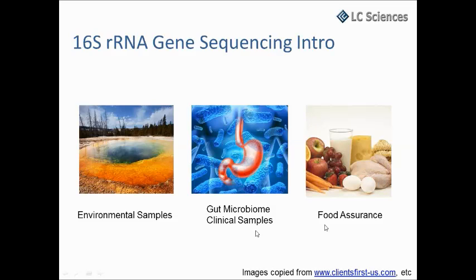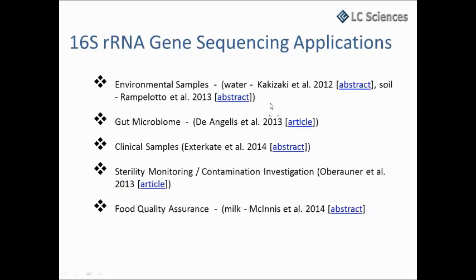So we also check these kinds of samples. But here again, we must keep in mind that this is all a mixture of bacteria. It's not a single colony anymore. We put a few references here to demonstrate the applications of 16S rRNA gene sequencing. Later you can take the slides and go through the details.